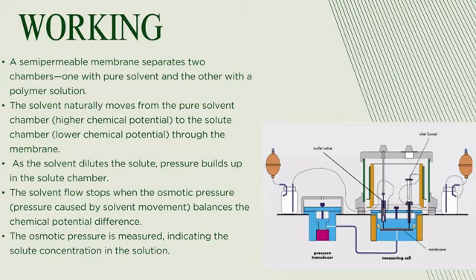The semi-permeable membrane here separates two chambers. One chamber is filled with pure solvent, for example water, and the other is filled with a polymer solution or any solution containing solute. The solvent chamber is sealed except for the membrane that allows solvent molecules to pass through. The solute chamber is left open to the atmosphere, meaning the solute side is exposed to air and can exchange with the surroundings.